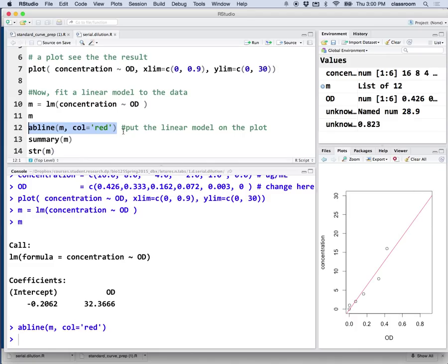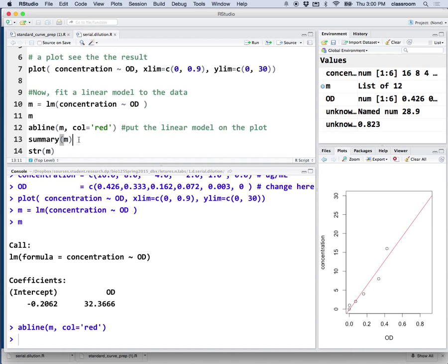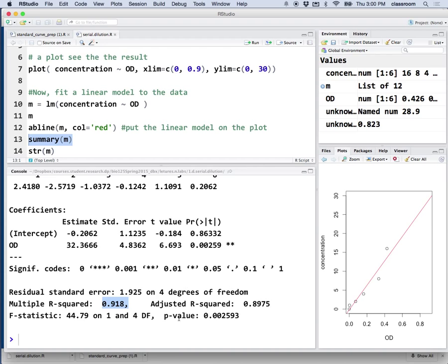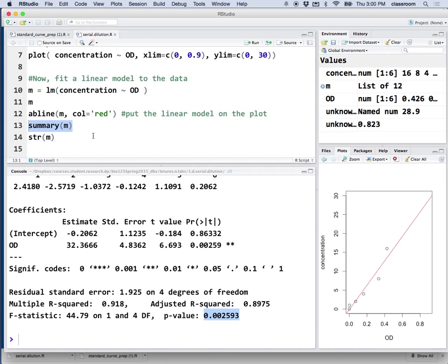Now if you have done some physics experiment, you know, every time you fit those dots with a linear line, there's many measurements you can measure. How good is, how linear that line is. One measure is called R square and the P values. In R you can see those numbers called summary. This one is actually 91.8% accurate. So, that's pretty good. And it's highly significant. That's a very small P value.